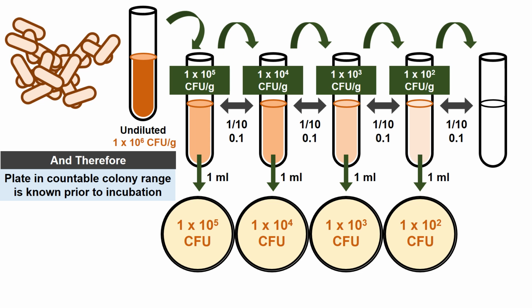That is the magic number. There it is. That's the plate I've been after. That is 100 colony forming units. That is the magic one, the only one. This is the only possible plate from this dilution setup where I did 10 full dilutions, where I'm going to get countable colonies in the range of 30 to 300. Before I even do the rest of this, how many colonies are you going to get on the next plate?